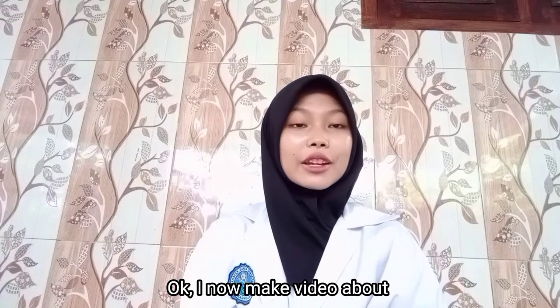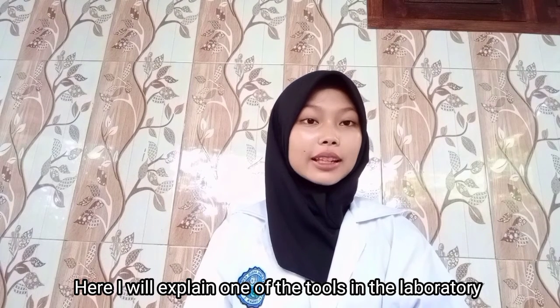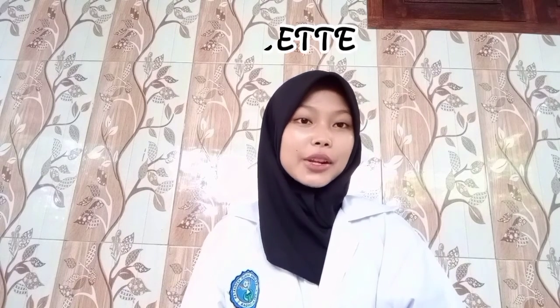A21222043. Okay, I am now making a video about the use of instruments in the laboratory. Here I will explain one of the tools in the laboratory, namely the burette.